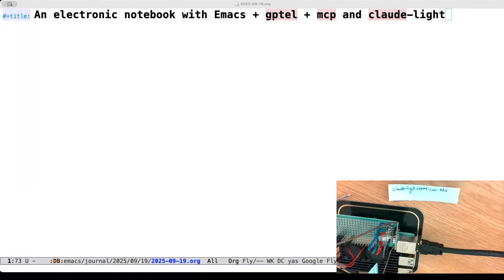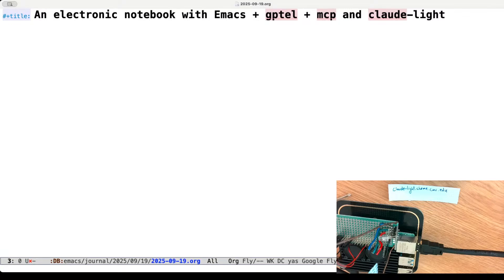Welcome back to the Cymax channel. Today I'm going to show you some work I've been doing with Emacs, gptel, and MCP in org-mode to design experiments, run experiments, and analyze experiments. We'll do this using clod-light, which you can see in the bottom corner — a little instrument I built that is remotely controllable. You can set the R, G, and B levels of an RGB LED and measure some outputs. This has been part of an exploration in using large language models to automate experiments and analysis.